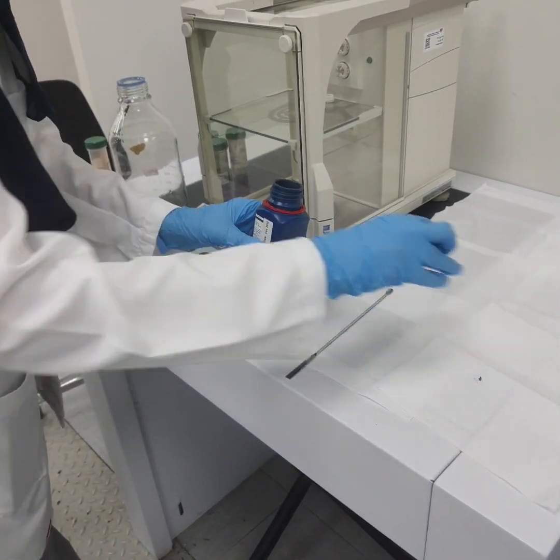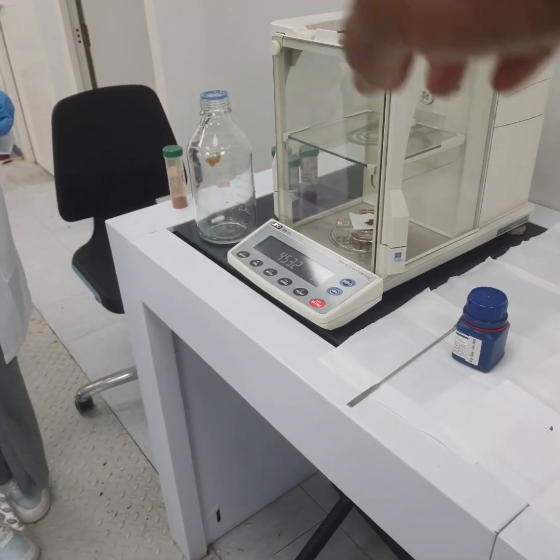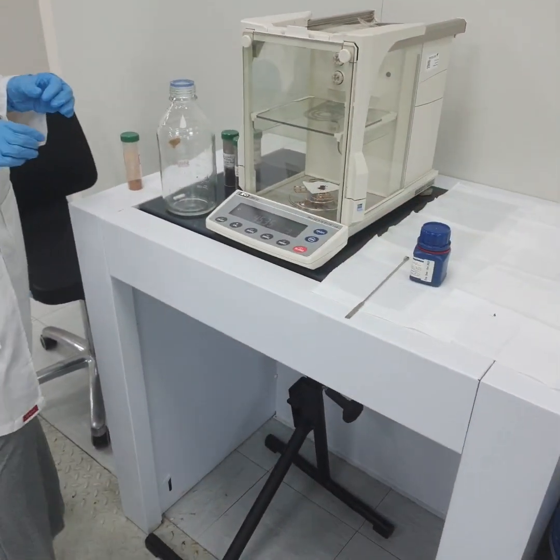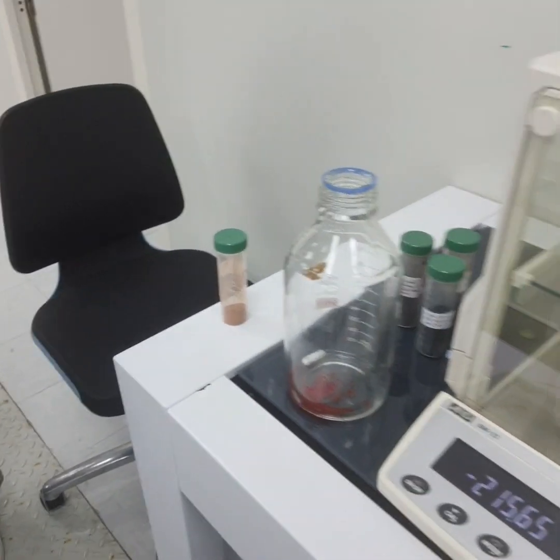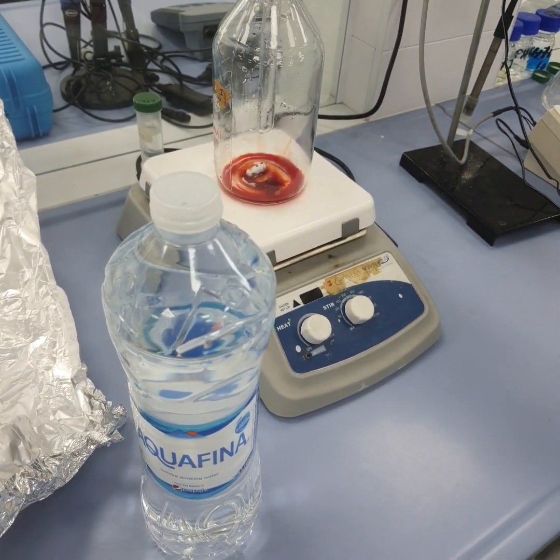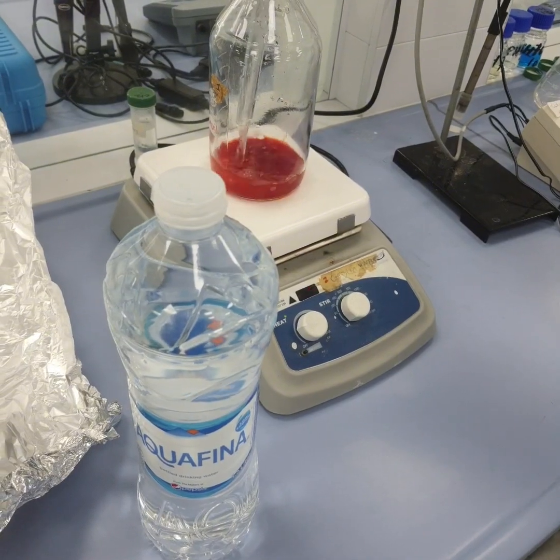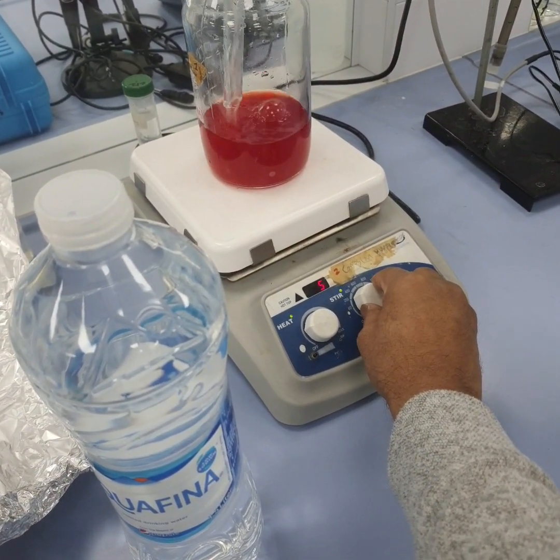Now what we need to do is transfer this to the jar. Let's transfer, take it out. Now we will add deionized water and shake it for around half an hour. You're pouring around 500, we need 500 more. Now try to shake slowly.